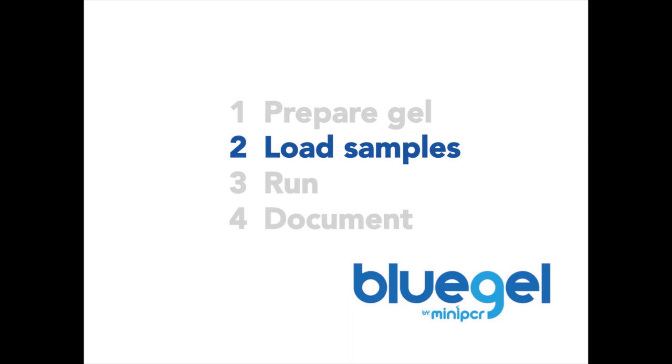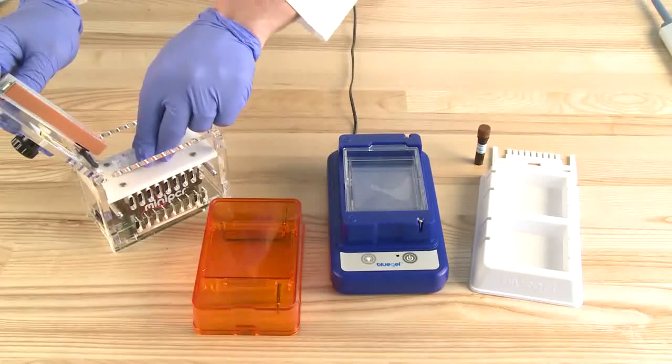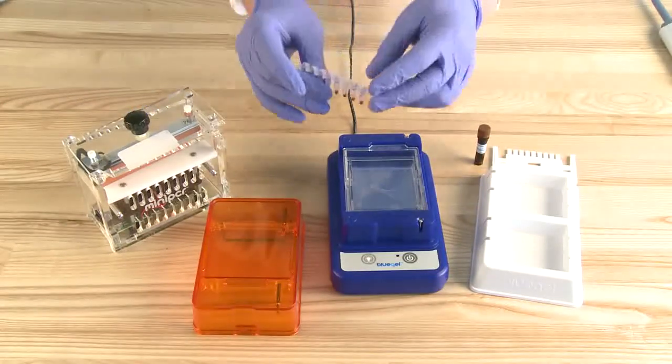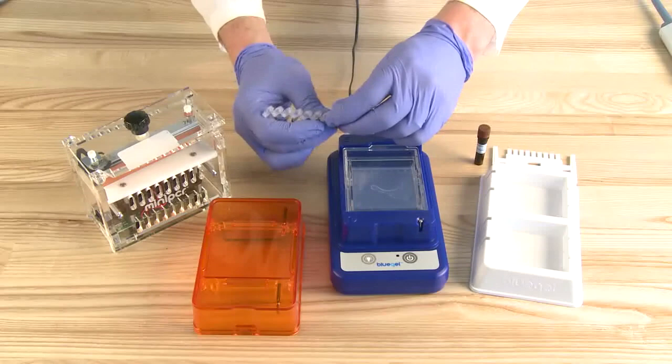Now you are ready to load the gel. If your samples did not contain gel loading buffer, now is the time to add it. All mini-PCR learning labs come ready to load.